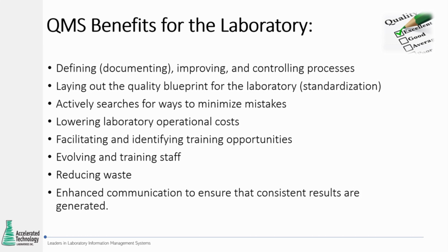You're always looking for ways to automate mundane tasks so that you can use your most valuable resources, your laboratory team members who are really all knowledge workers, most efficiently. And then also identifying opportunities for training. Oftentimes people want to skimp on training.